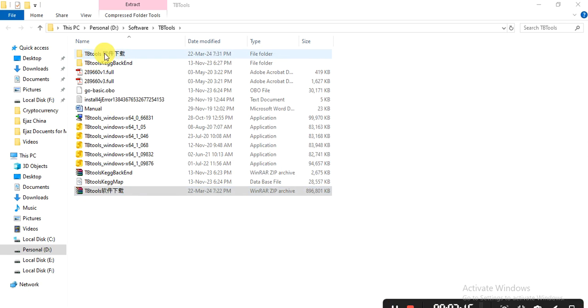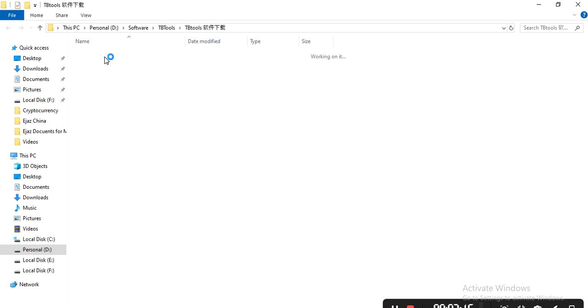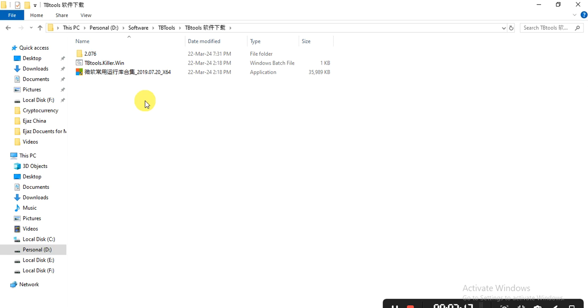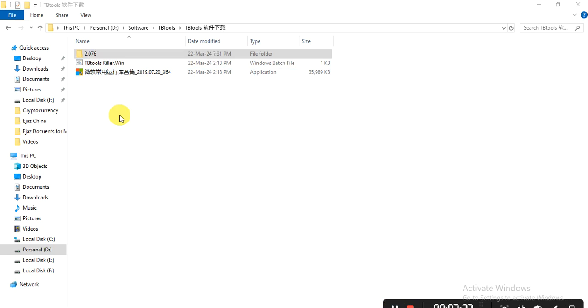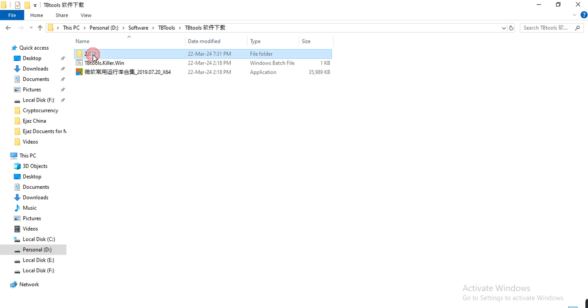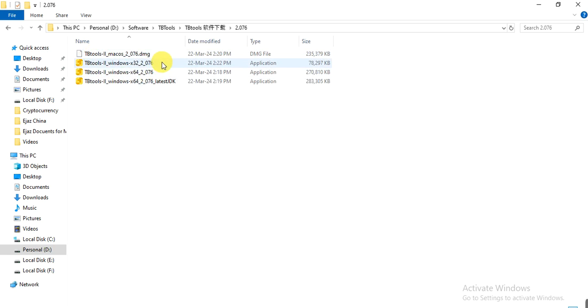Now our folder is extracted. Open the folder and you can see this is version 2.076, the latest version of TBtools. Click on it.